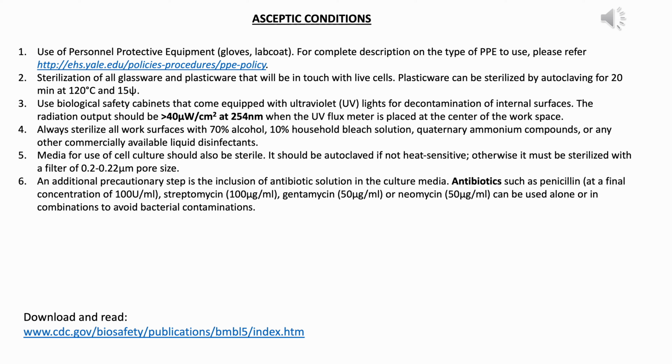And then if the biosafety cabinet is cluttered, then many of the bacteria or spores which are not in the direct path of the UV, that is, if they are present underneath the 6-well plate or underneath some tissue paper box or in any shadow region of any of these things, then these organisms can successfully thrive. So when you're turning on the UV light, the entire biosafety cabinet should be as empty as possible.